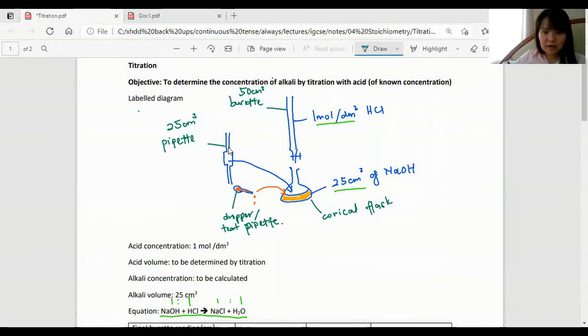Keep in mind that the burette is not to measure the volume that it contains, but it's to measure how much of the volume went into the conical flask.